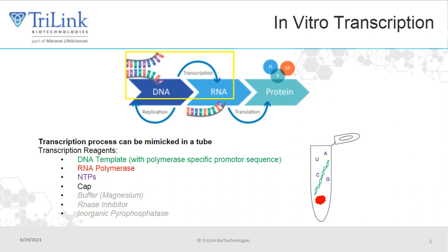However, in most reactions, there is an inherent and aberrant activity of these polymerase enzymes that results in double-stranded RNA, an undesired byproduct of the IVT. Optionally, a cap or cap analog can be included in the reaction to synthesize fully mature mRNA molecules in a single step.